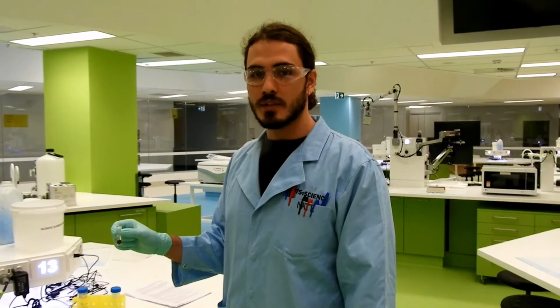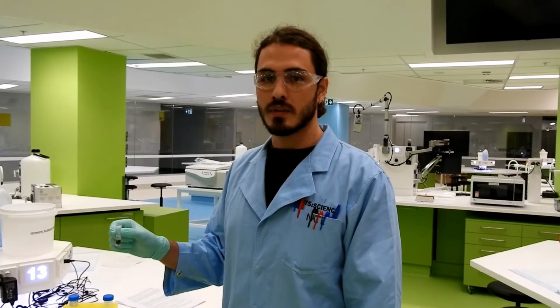The next step involves putting your sample into a bead beating tube. This tube contains beads which will be used to mechanically break apart the cells to release the DNA.